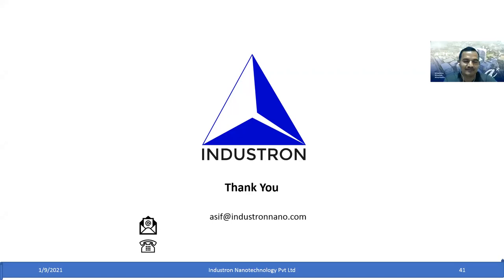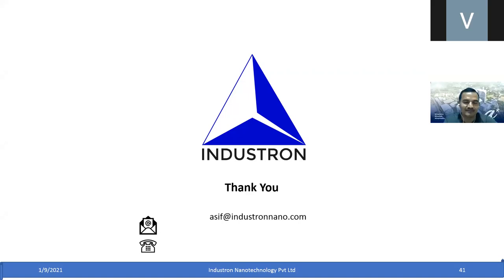Yes, with Raman, we have a paper. This was done some time ago, and not many people have done it. We have the instrument, so we are doing some experiments. It is really useful for studying polymorphs, in situ transformations and things like that. You can also go to a little bit of low temperature. It is very good. It's stable actually, it's not a problem.